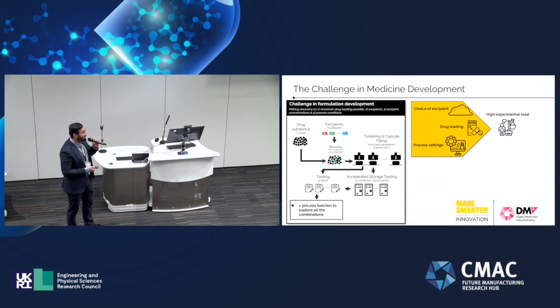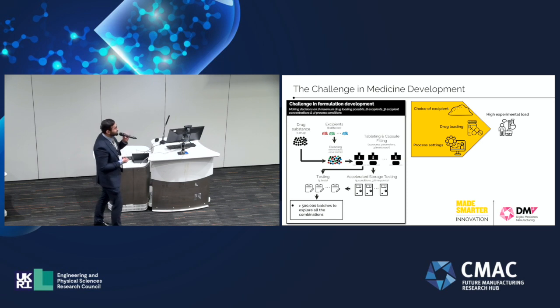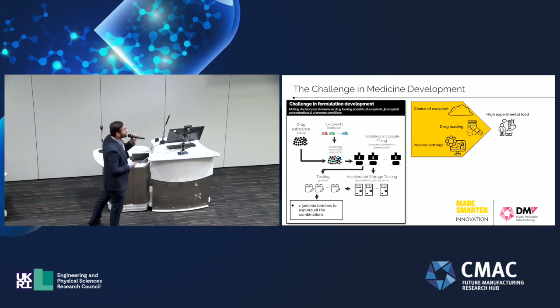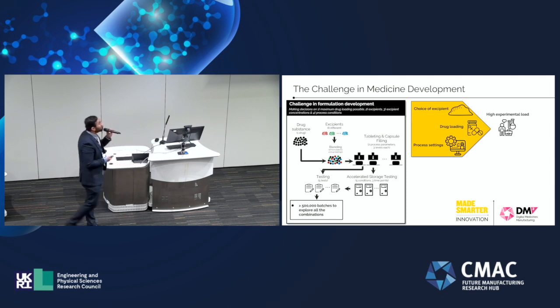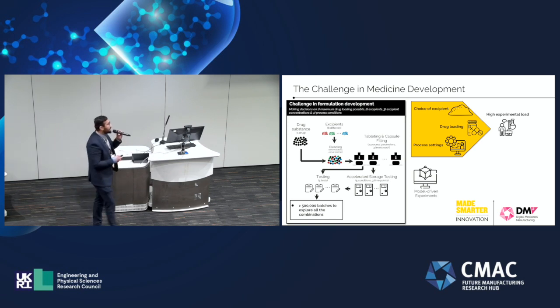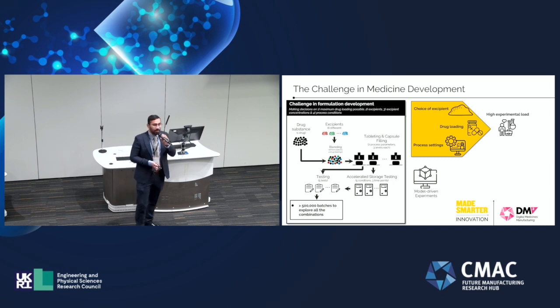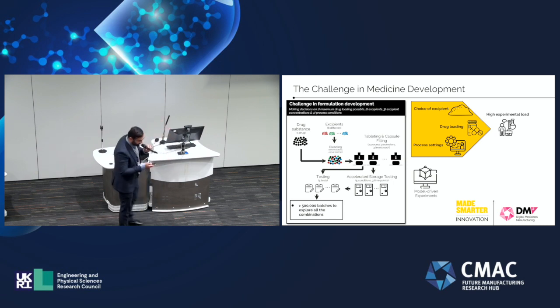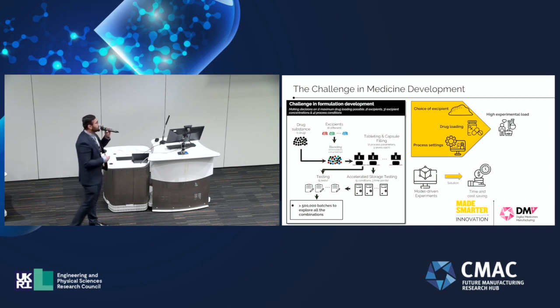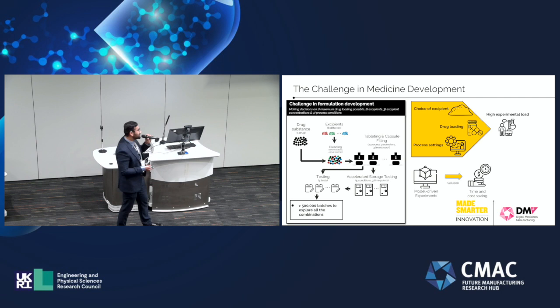One of the main challenges that we have highlighted is that the experimental load increases as we come across multiple choices of excipients, and where we have to maximize the drug loadings and optimize the process settings. So what we are proposing is a model-driven approach where the models can inform the system what experiment or what parameters we need to use to run that specific experiment. That's something we are hoping can lead us to reduce the time and the cost associated with it.